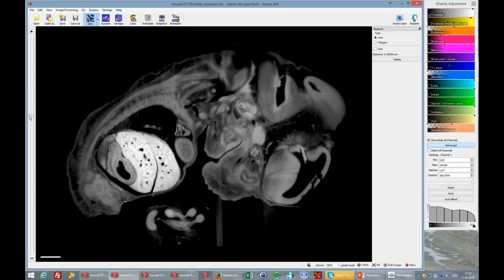Okay, the slides are nice and beautiful already by themselves, but of course we want to do more with this. So there, I want to show you some other 2D visualization tools which we have inside Imaris. That would be, for instance, here the section view.